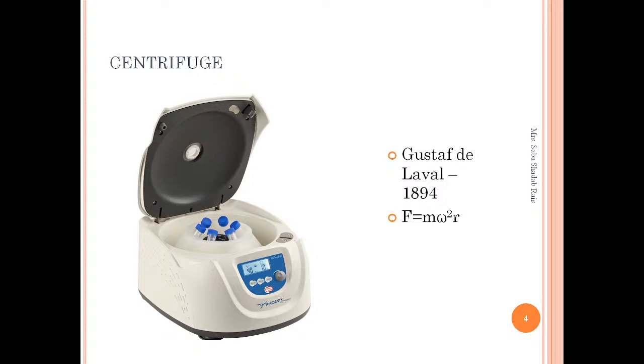So here there are two very important points to remember. The first thing is the RPM, revolution per minute. That means after applying the centrifugal force, how many revolutions this machine is taking in a minute.